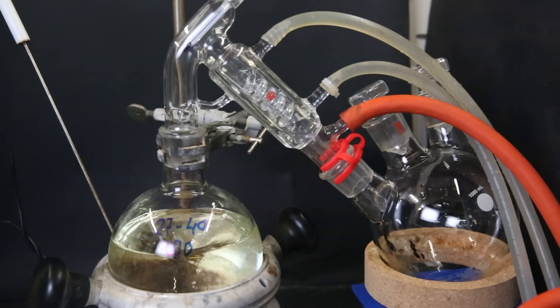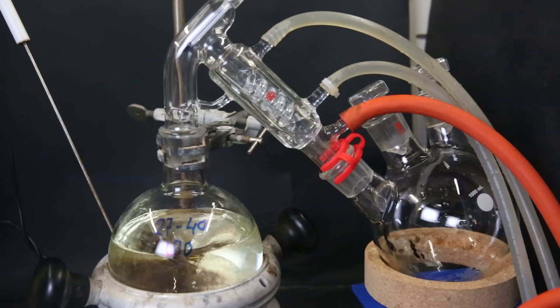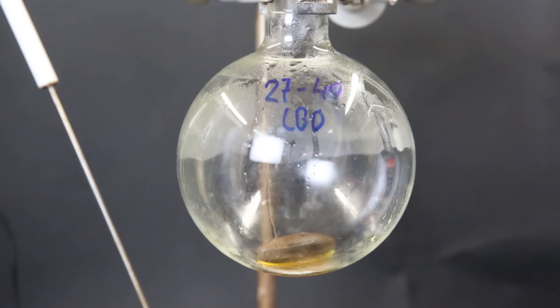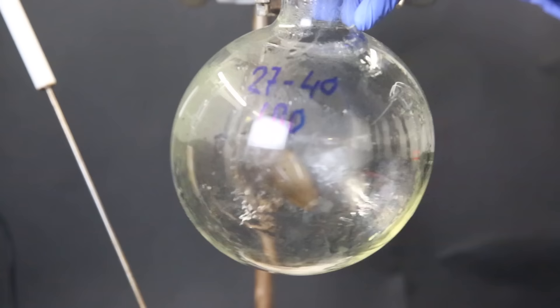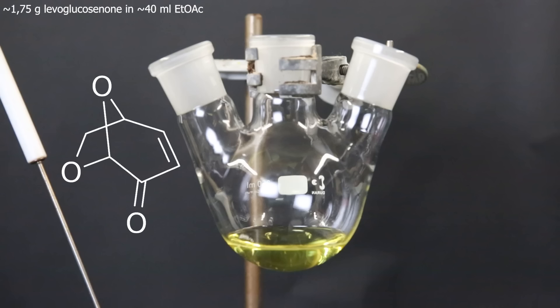Now I simply have to boil off all of the solvent, so I set it up for a short path vacuum distillation. When all of the solvent is gone, I am left with a bit of yellow liquid, which I transfer to a smaller flask with a pipette. I also washed the flask twice with some ethyl acetate, and the yield of levoglucosanone turned out to be 1.75 grams. Now that I have some levoglucosanone dissolved in ethyl acetate, I can move on to the next step and make the cyrene.